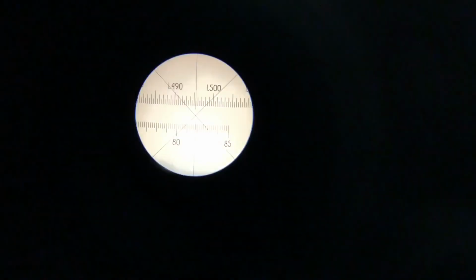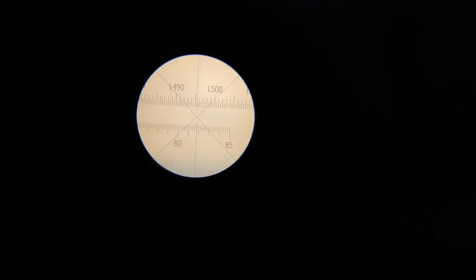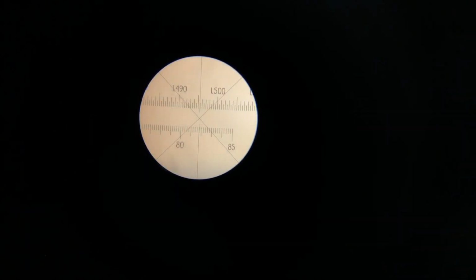It's pretty good. And then I'm going to go up to the crosshairs, get it set. We then depress that little knob on the side. We then get the vernier scale. We see that the line is dissecting very closely to 1.495, but it's close to the second medium-sized notch, which would be 1.496.